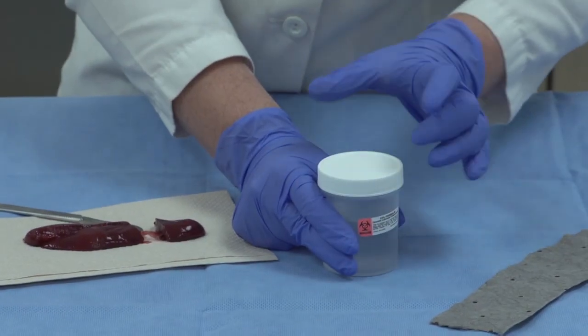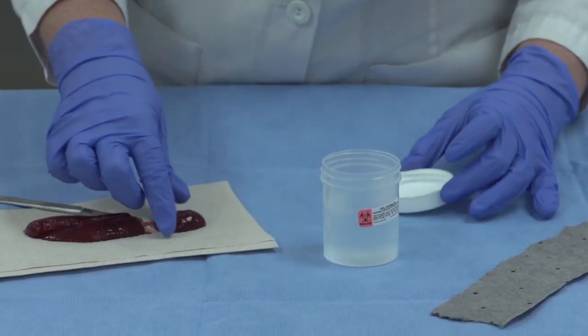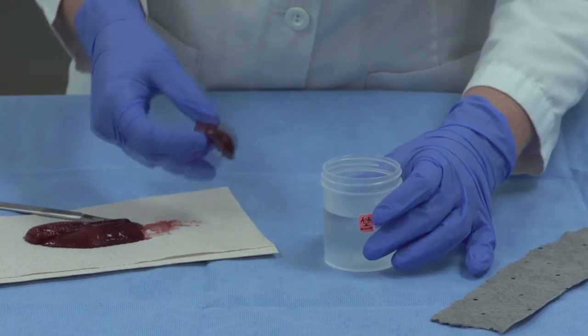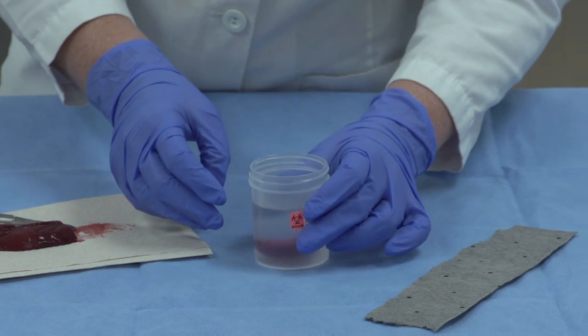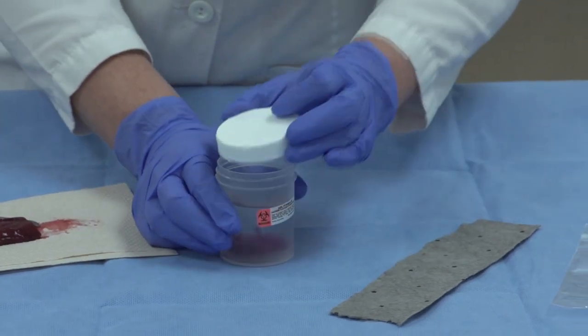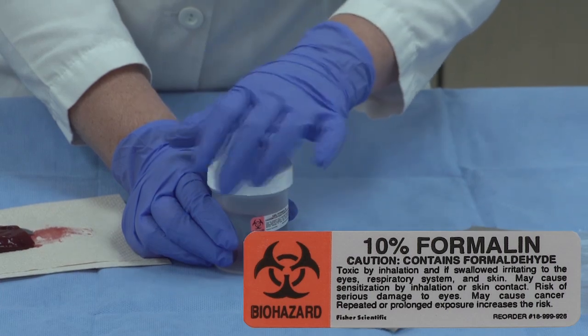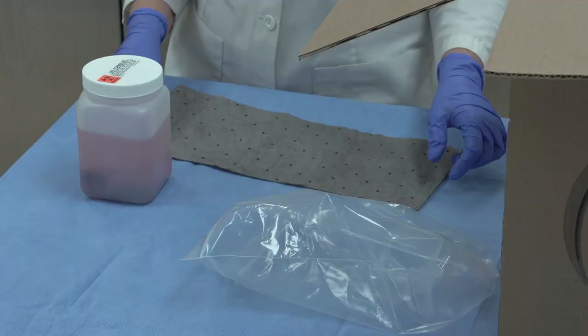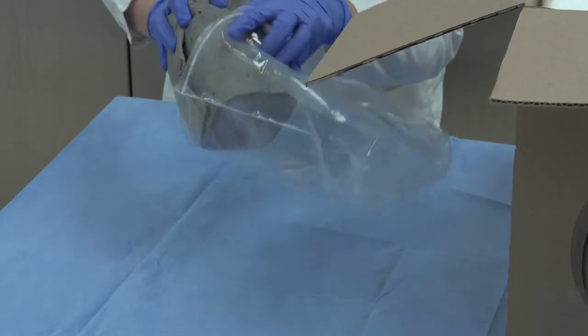If submitting tissues in formalin, please use a sturdy plastic wide-mouth jar with a screw top as the primary container. Tupperware, Ziploc bags, and Whirlpack bags are not designed for, nor are they capable of containing liquids through the rigors of transportation. The jar must be labeled indicating that it contains formalin. Wrap the jar in absorbent material and place it in a well-sealing plastic bag.